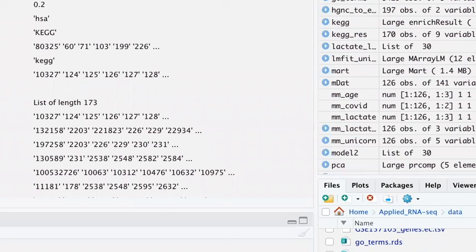Sometimes you also use the double square brackets when it comes to lists, to index the elements that you want to select. Within that, you can also index it further. So it really depends on the data type that you have. Each data type has its own ways of pulling out or working with the data. Lists are, I find, quite difficult to work with when pulling stuff out. Okay. Thanks, Alejandro. That was a really good explanation.